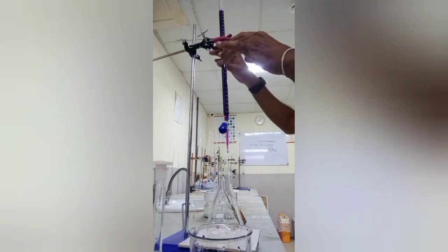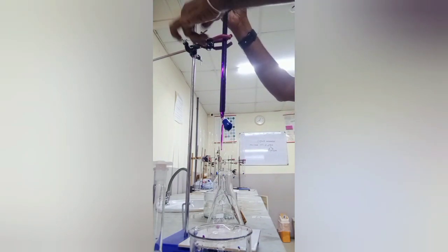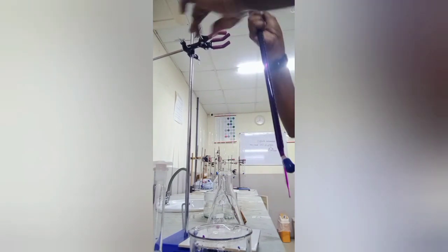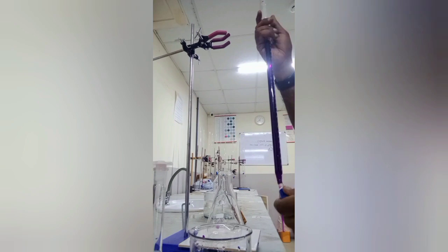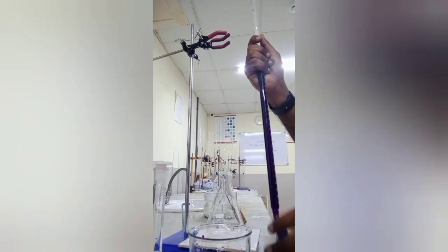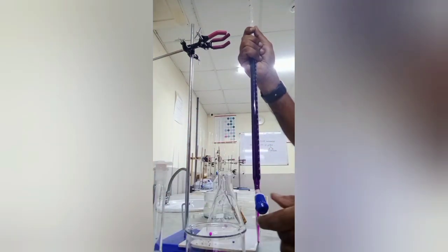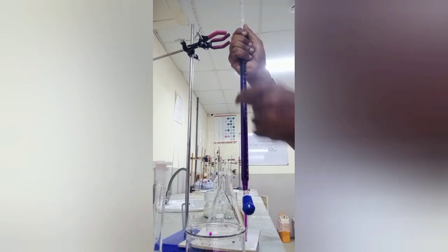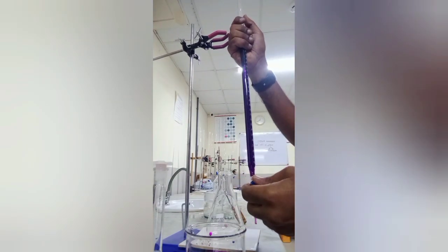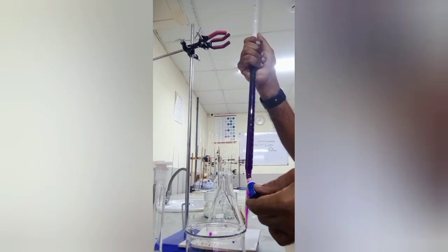Before using the burette, please wash the burette thoroughly and check the burette with water to see whether there is any leakage. If there is any leakage when you are filling the KMnO4, it will become a problem and the solution will be wasted, and then the teacher will not give more. So before using the burette, wash it, fill it with water, and if there is any leakage in the knob or anywhere, you can inform the teacher. The teacher can give another burette. You can exchange the burette.